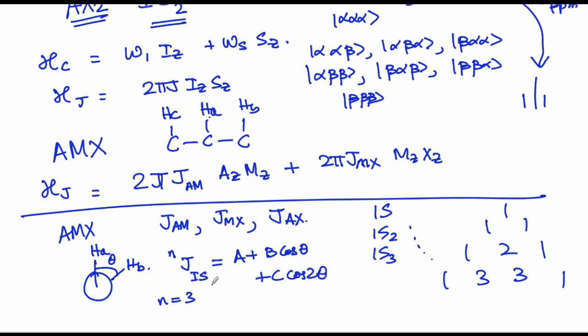So given that you are able to measure the scalar coupling, you would actually be able to say what is the dihedral angle between these two protons. So this is what gives NMR an immense power on the fact that the magnitude of couplings would help you understand which spins are coupling with one another. And on top of it, the magnitude of coupling could also be interpreted for certain cases using the Karplus equation, which helps you further determine structures for molecules.